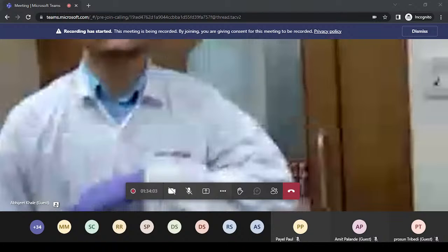This is CAMAG ADC2. This is CAMAG ADC2, a completely automatic chromatographic development chamber. Here, a normal twin trough chamber we are placing, and the upper assembly will completely enclose the chamber. And in this upper part, we can hang our plate of interest just like this. So this plate is in my hand. So I am hanging this plate on the upper part of the ADC2.